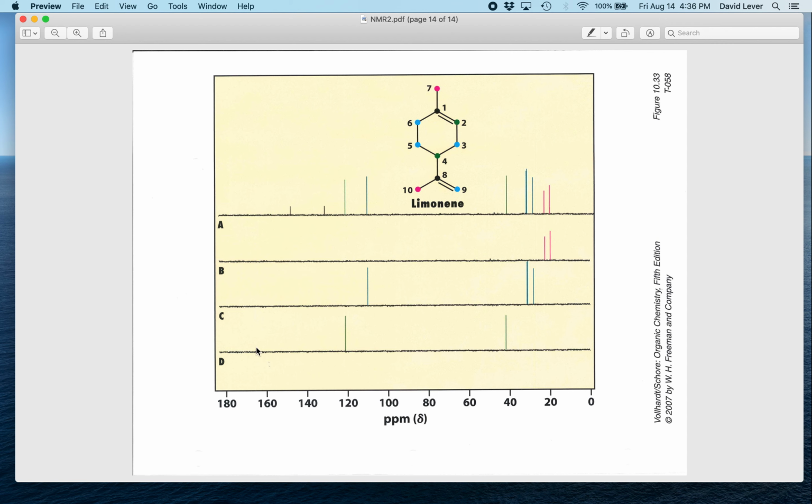But this is a full DEPT spectrum where we've got the full spectrum and then just methyl, just methylene, and just methine peaks. So the ABX pattern is something you should be prepared to recognize, and the difference in coupling constants between geminal hydrogens on an sp3 versus geminal hydrogens on an sp2, long-range couplings, a 1,3 coupling that you see across an aromatic group, or that you see across an alkyne, those are relevant. And then the different couplings for cis and trans on the alkene are also things that you should understand.